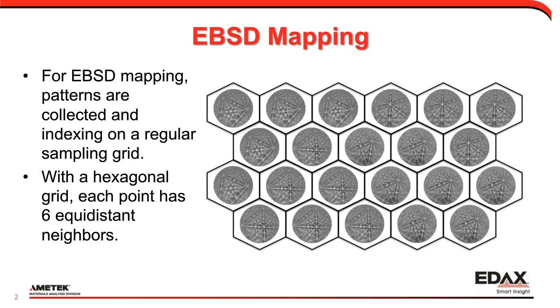I have a feeling your data quality would probably go down if I start to do second or third or even fourth away from my center point. So I just don't think that would be a good thing. Again, there's no reason for us not to be able to do it, but I don't think the data quality would really be worth it to look into it. So with that in mind, I've honestly answered all the questions.